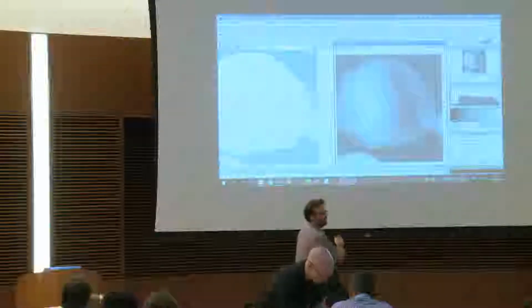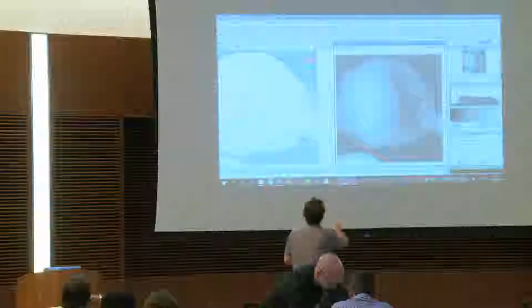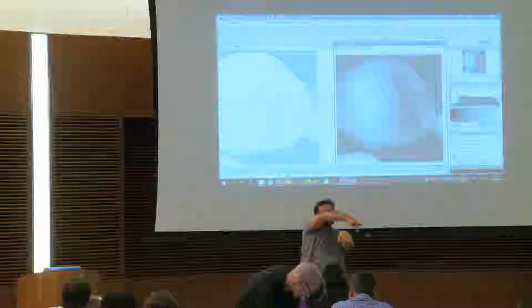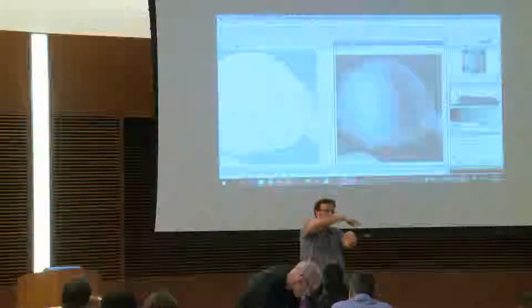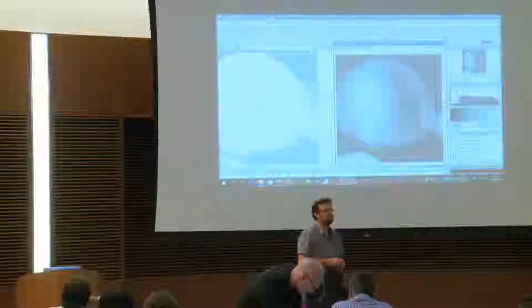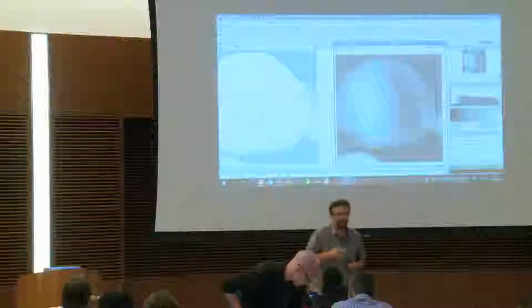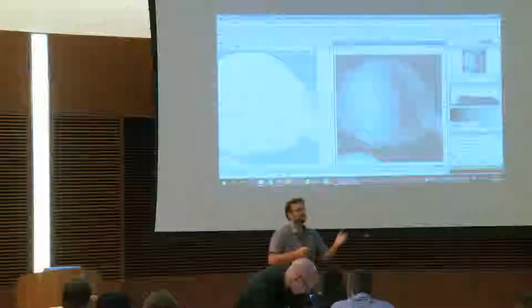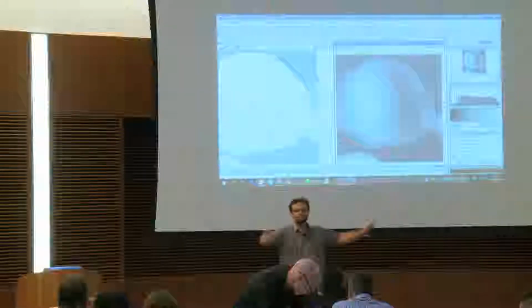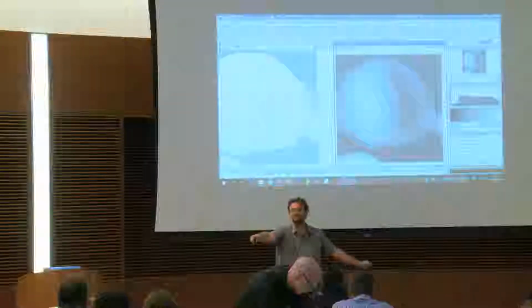I have another question for you. Do you believe the scan is that way or that way? Or is it going to do this, or does it go back and forward? Both directions here. You agree? Okay, you say both directions. No, you don't agree? What would you say?